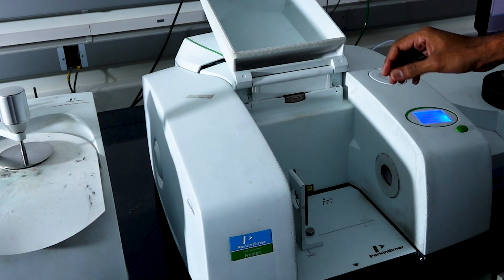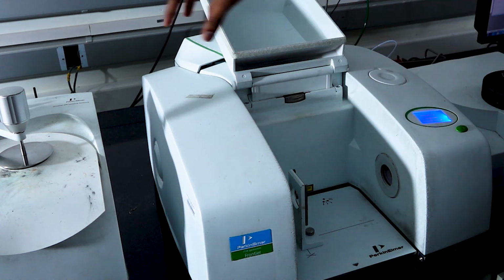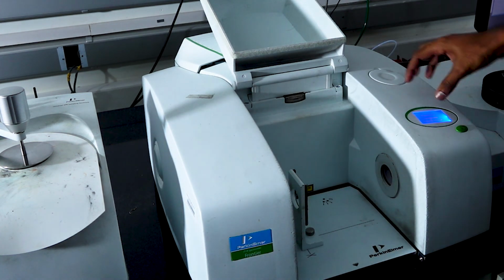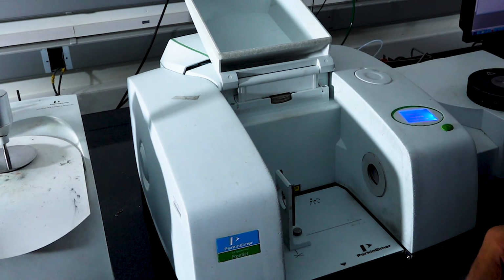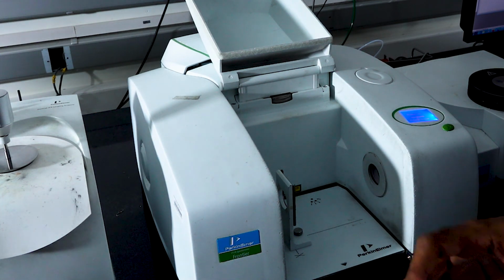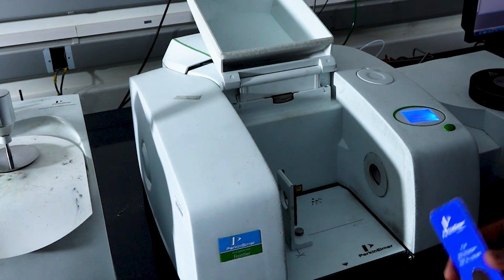Now, let's have a discussion about how to do an FTIR. Presently, the FTIR spectrometer is set to the transmission mode. So the IR light starts from here, passes through the chamber and reaches the detector. Any sample which I am keeping in the beam path can be analyzed using this mode. Initially, before starting an FTIR measurement, the first thing you need to do is to take a background. Background is nothing but you don't keep your sample.